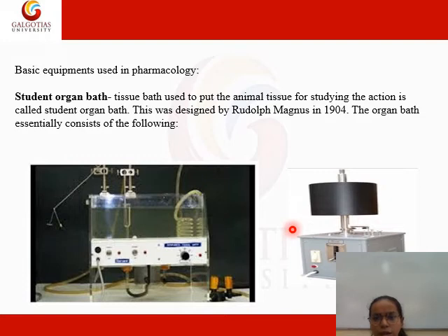Aluminium and magnesium tips are best suited for the purpose. The paper used to cover the drum should have a smooth writing surface to reduce the friction between the tip and the paper.